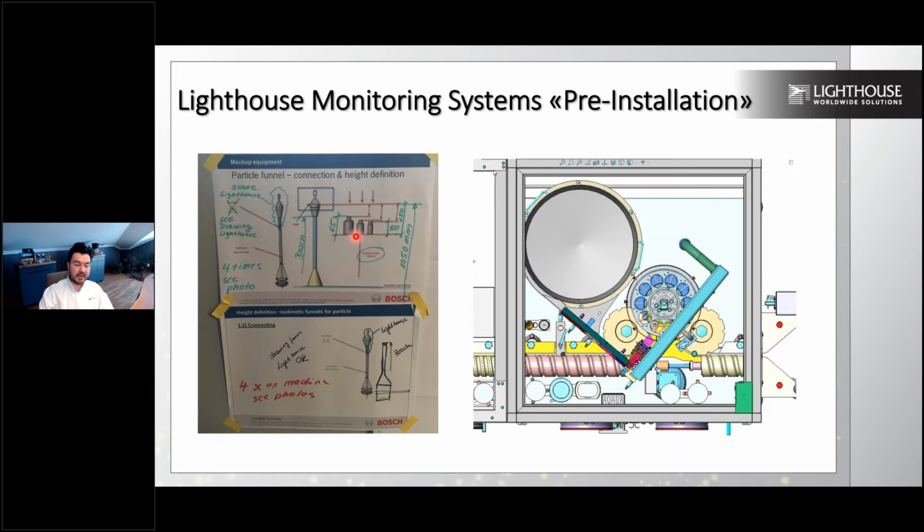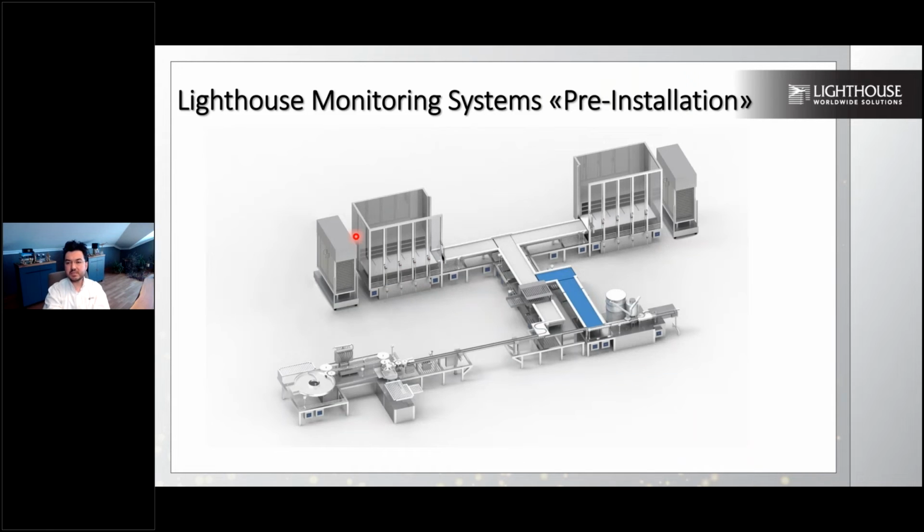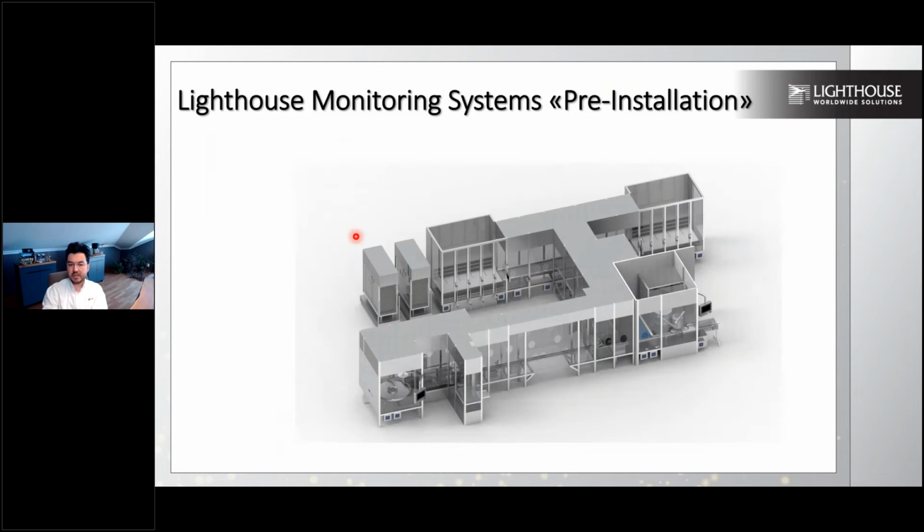But again, if your change part supports very different sizes of vials, you have to verify that none of them are outside of this 30 centimeters, and that none of them are above your particle counter isokinetic probe. So once you finalize your system design completely, let's take a look at it first. That's my system design as a wrap.